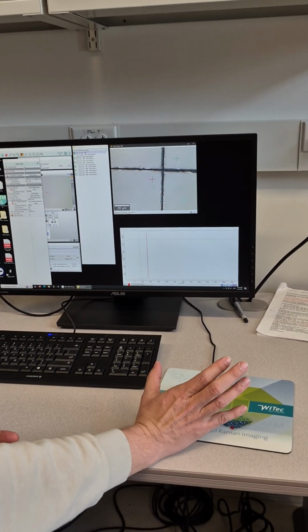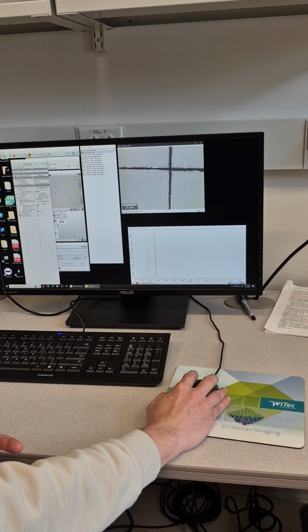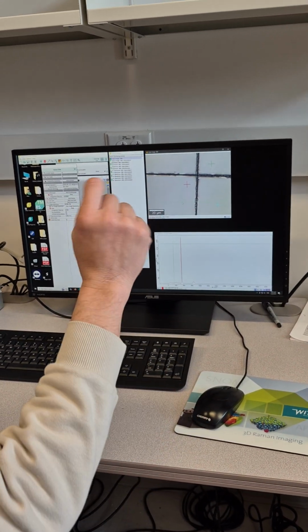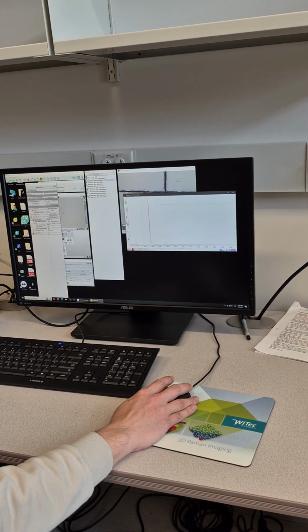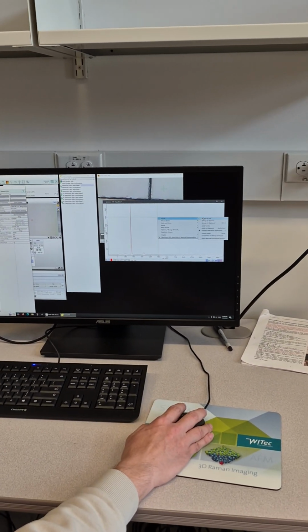You can save both, and if you don't like this scale bar or this cross, you can save the original image and draw them yourself. So that's how you deal with the image file. For the spectral file, you just double click to show the spectrum, right click, and export the bitmap to file.